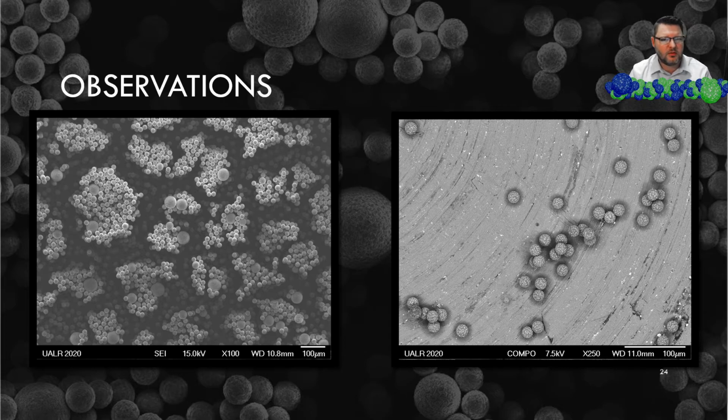And then there's a couple that are just a little bigger. And if you look real close, there's a very, very small handful that are somewhere in between. But it seems like they're pretty much these smaller ones or the larger ones. Using this image on the left, I used the scale at the bottom and was able to get not an exact measurement, but an approximate measurement of the sphere sizes.